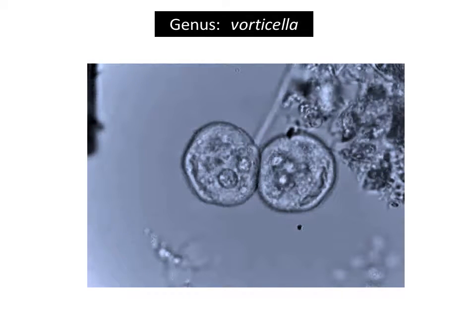The head of the stalk can be seen through the base of the parent cell. As cleavage and separation proceed, the daughter cell has shifted its basal location sidewards, and only the parent cell retains direct basal connection to the head of the stalk. The daughter cell will thus further establish its separation from the parent cell in anticipation of its development into a telotroch.